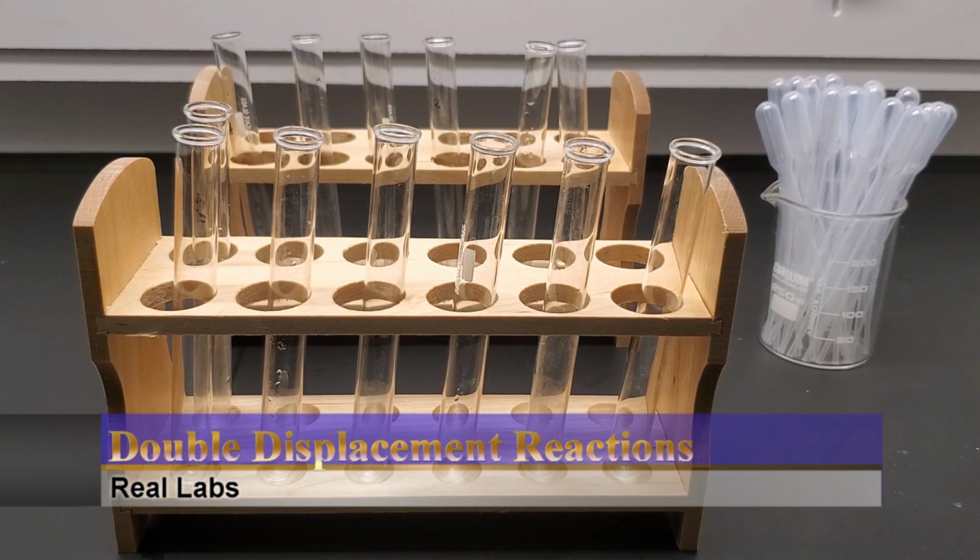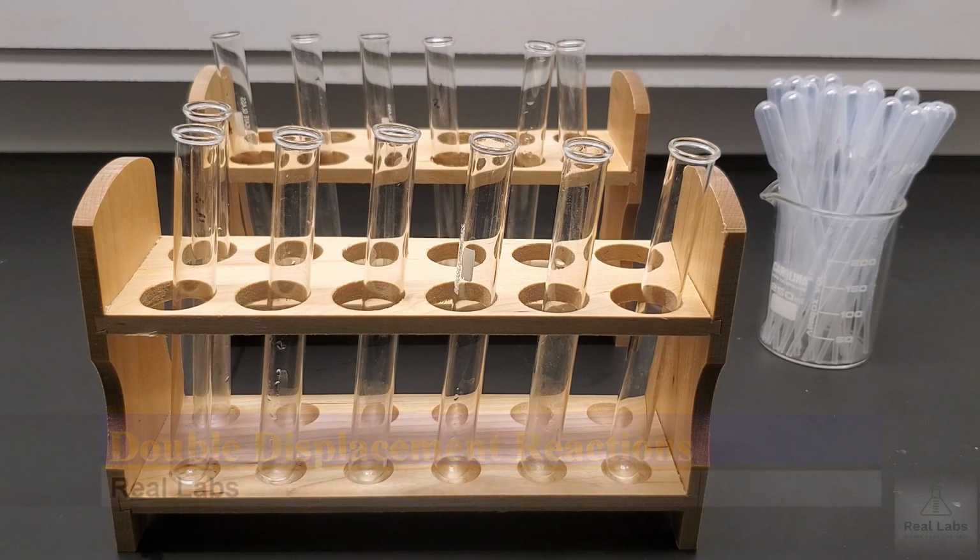In this lab, we're going to be looking at double displacement reactions. Very specifically, you've been learning about how when two ionic systems react with each other, if they react, they can generate precipitates, they can generate gases, liquids, solids, or there could be no reaction at all. And a lot of the decision is whether or not you'll actually see reactions based on solubility.